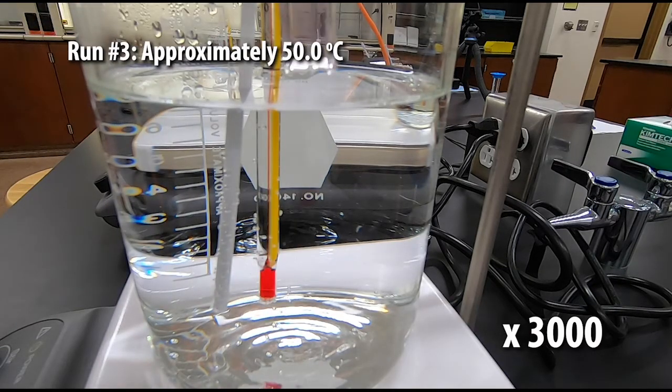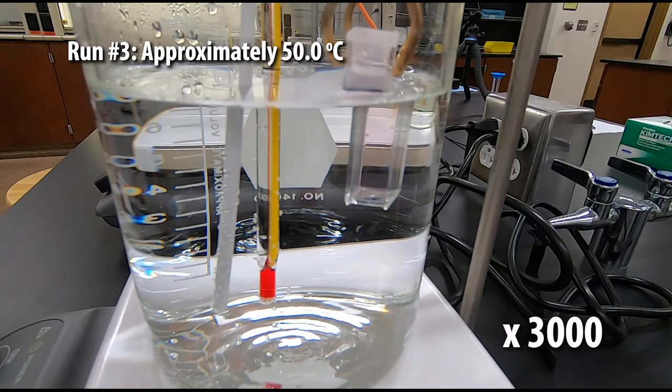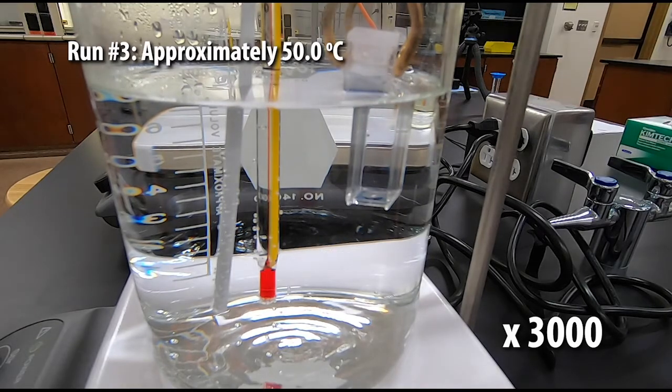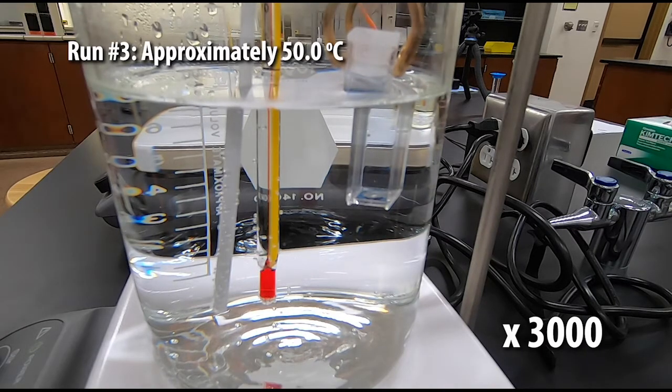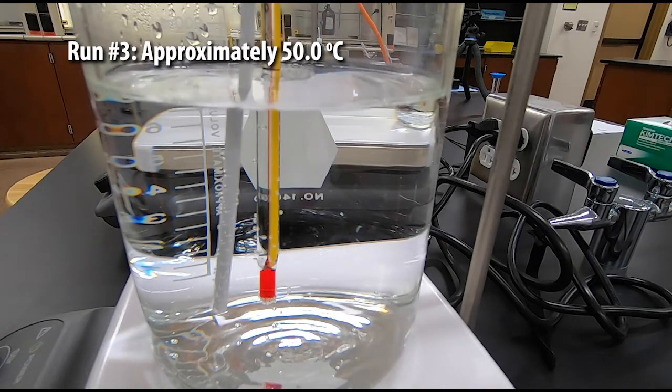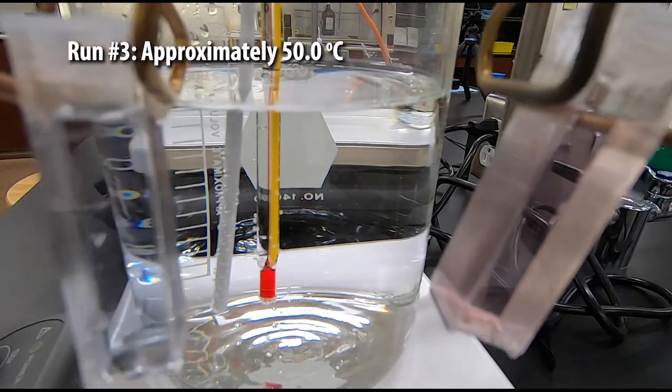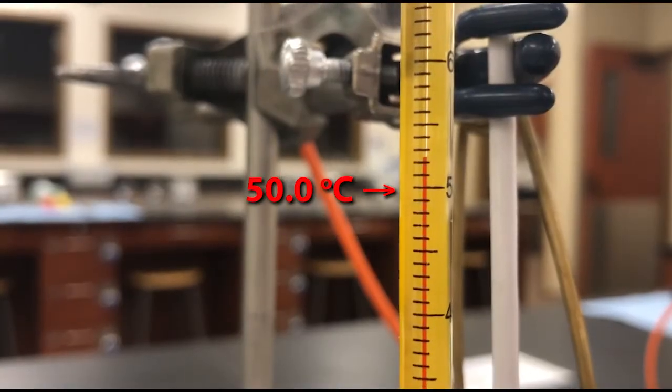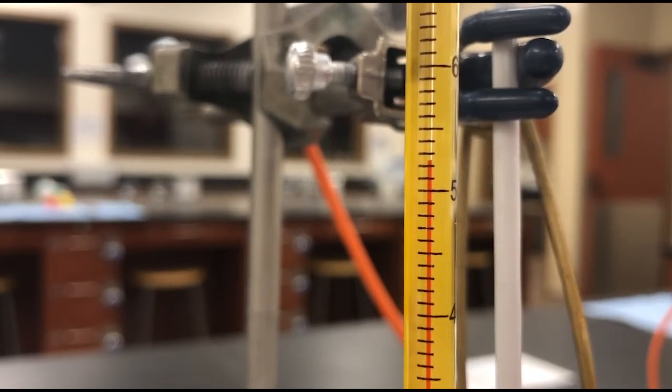Here we have our second water bath. This water bath has a temperature of approximately 50 degrees Celsius. You can see that there's an even greater shift to the blue compared to the first sample. Here's our thermometer. The long line is 50 degrees Celsius. Write down what the actual temperature is in your lab notebook.